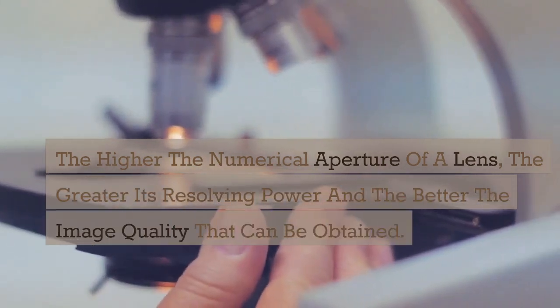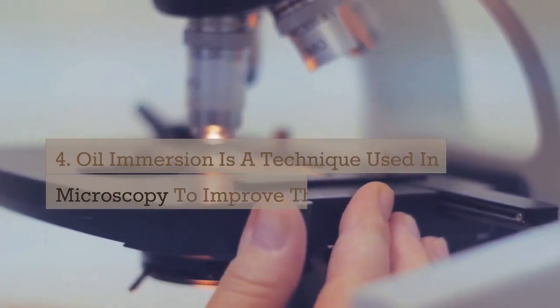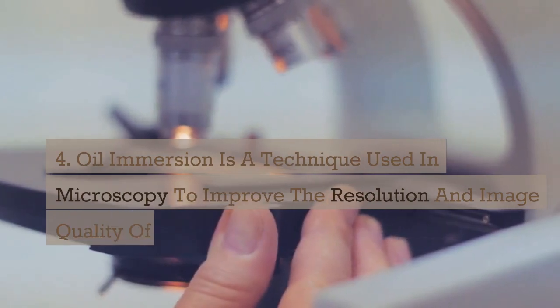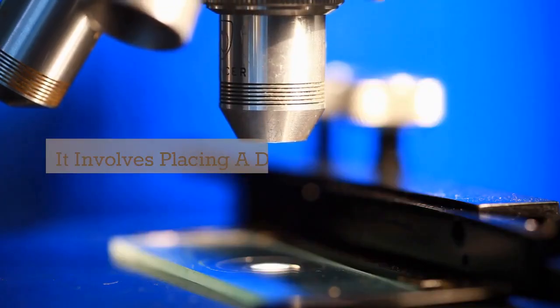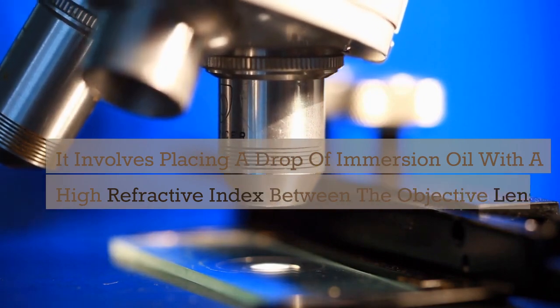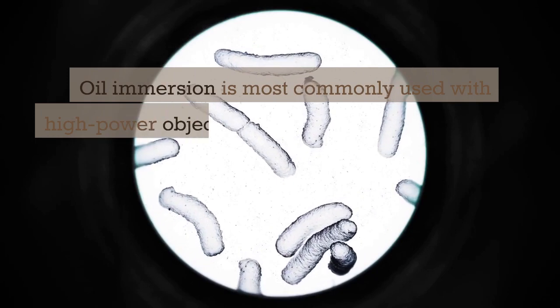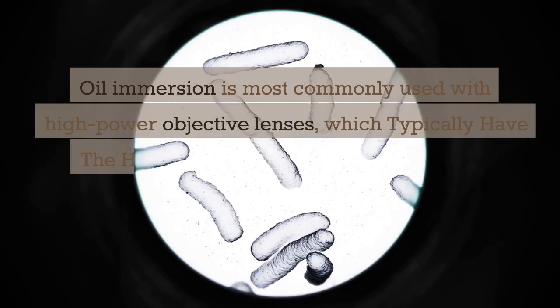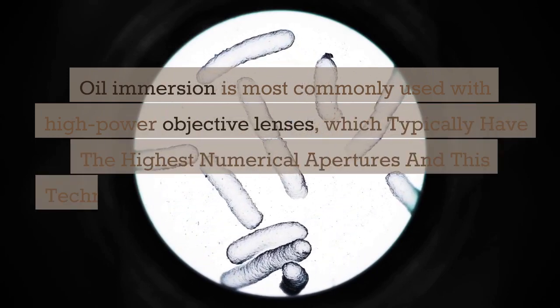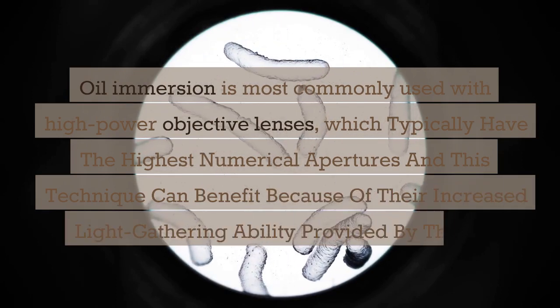4. Oil immersion is a technique used in microscopy to improve the resolution and image quality of specimens. It involves placing a drop of immersion oil with a high refractive index between the objective lens and the specimen. Oil immersion is most commonly used with high-power objective lenses, which typically have the highest numerical apertures, and this technique can benefit because of the increased light-gathering ability provided by the oil.